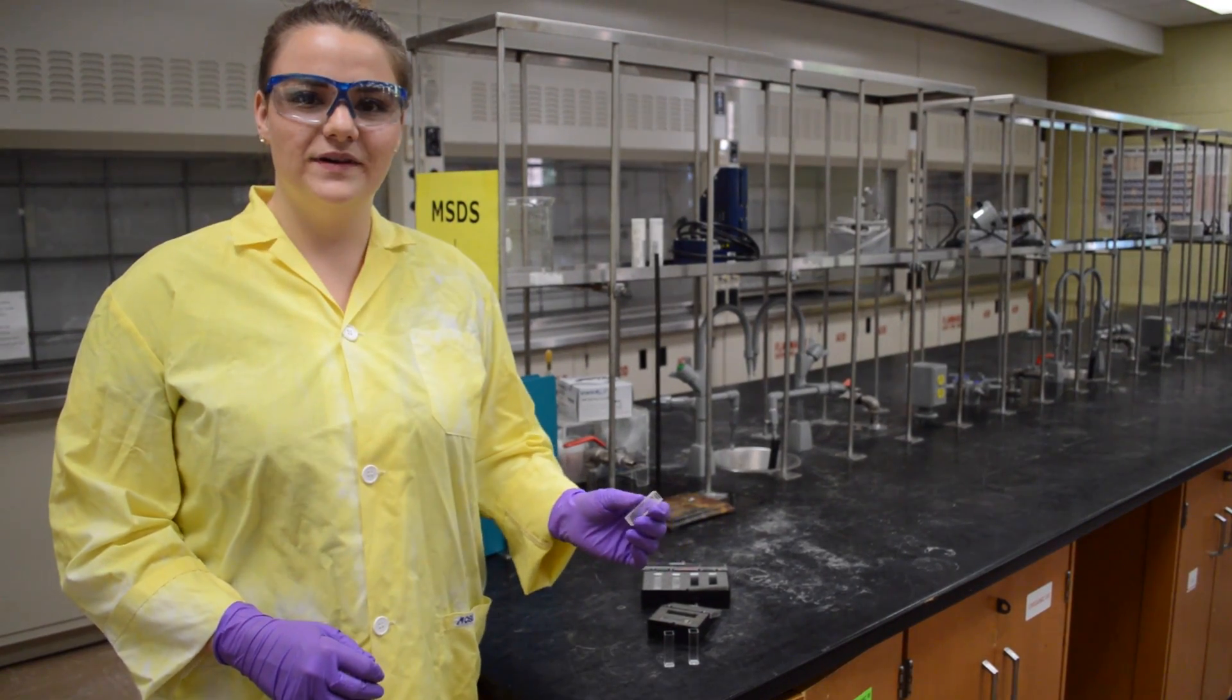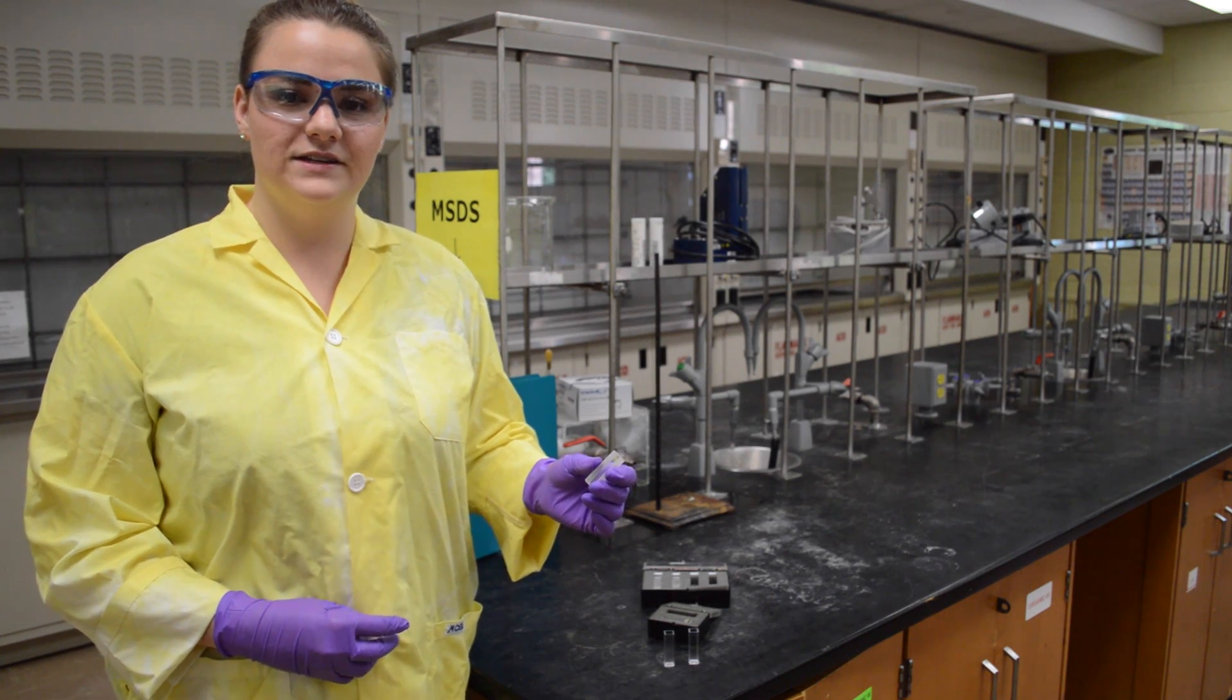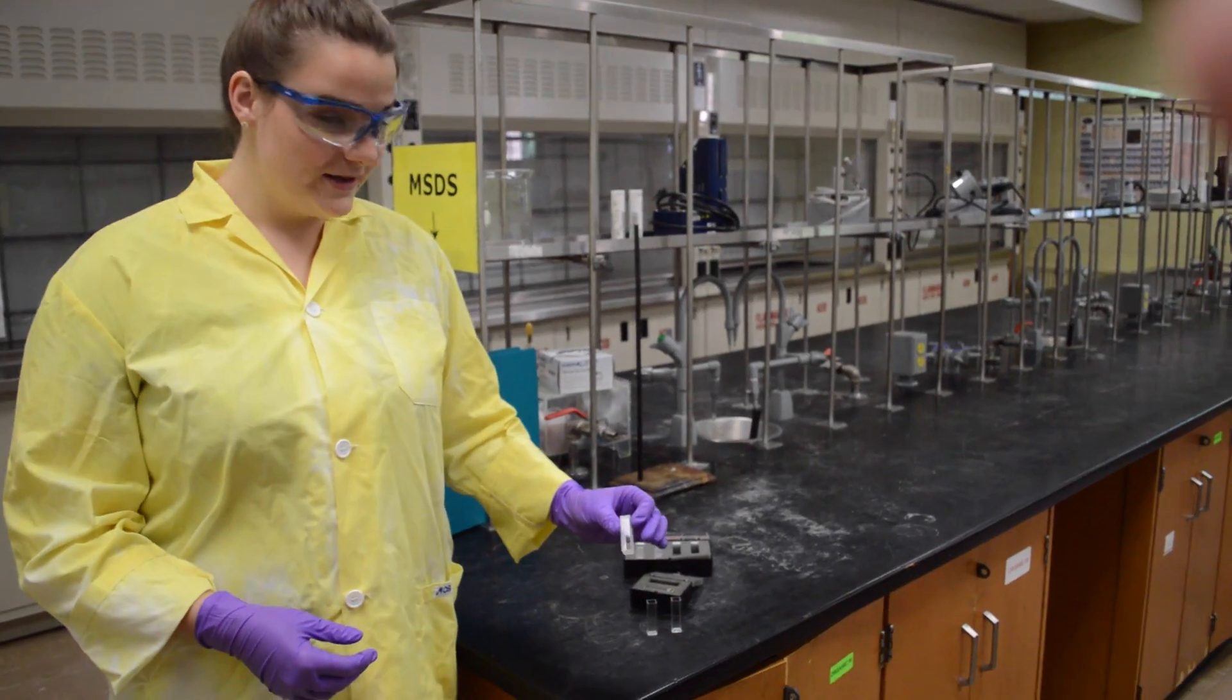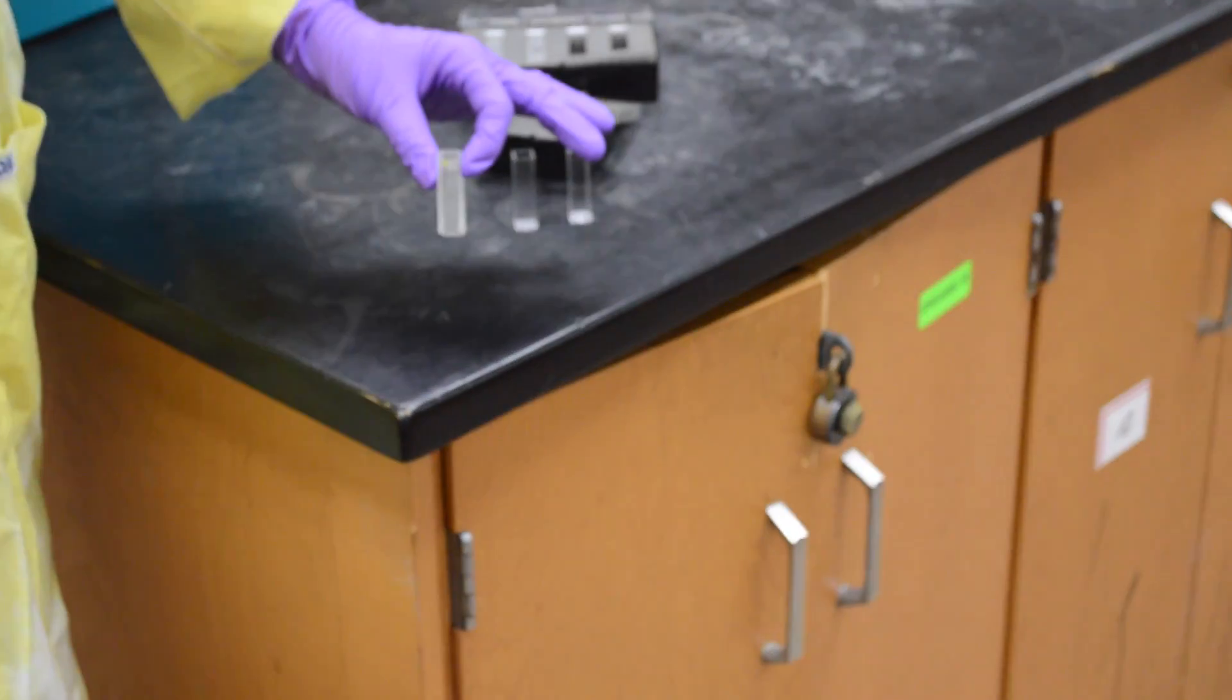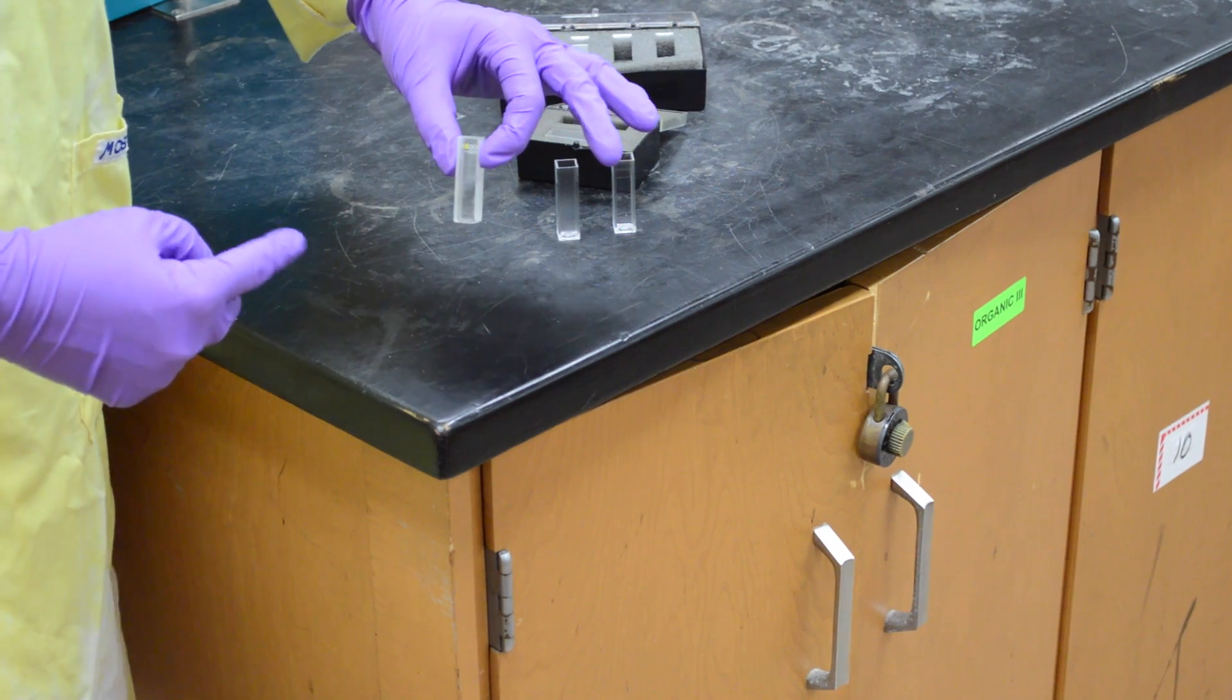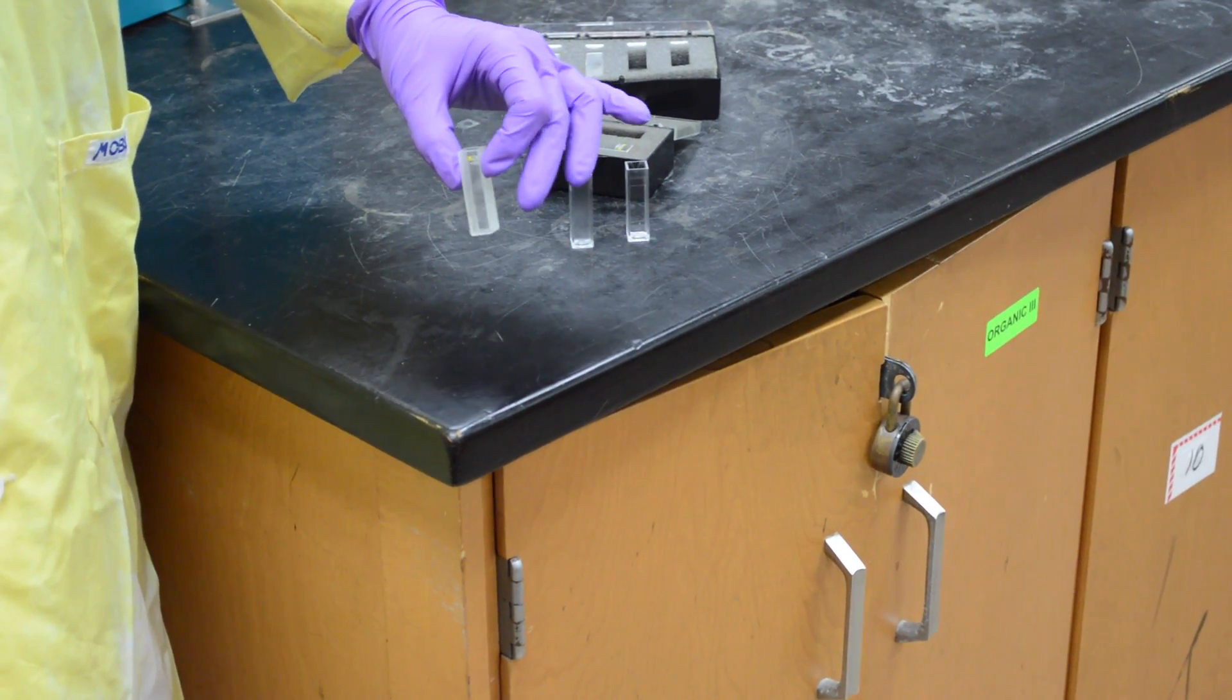The second type of cuvette is a glass cuvette and this is used for all solvents and it is useful in the visible range. As you can also see here, there is a clear side and an opaque side, so you would only want to touch the opaque side once again as the light passes through the clear window to collect the data.